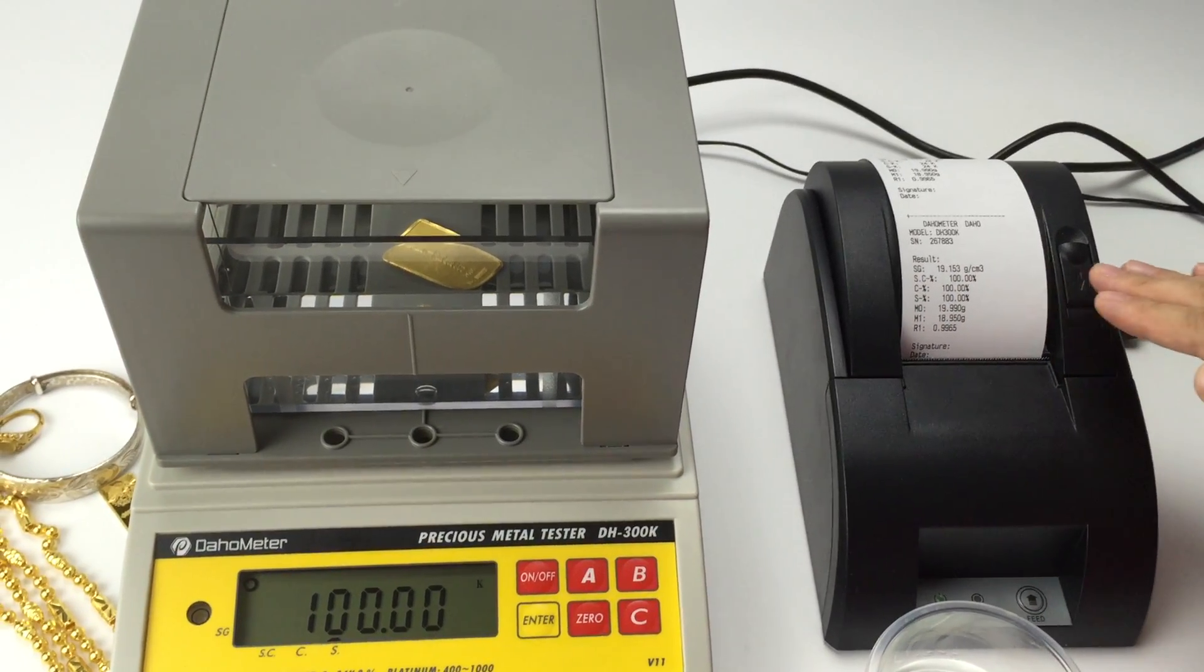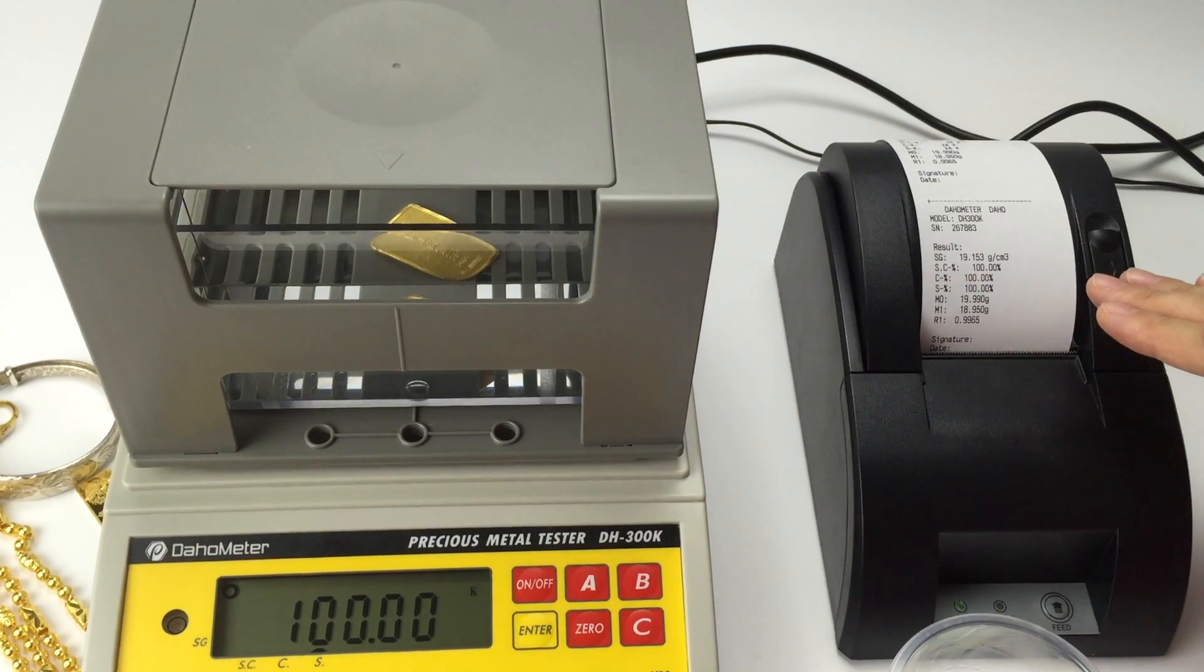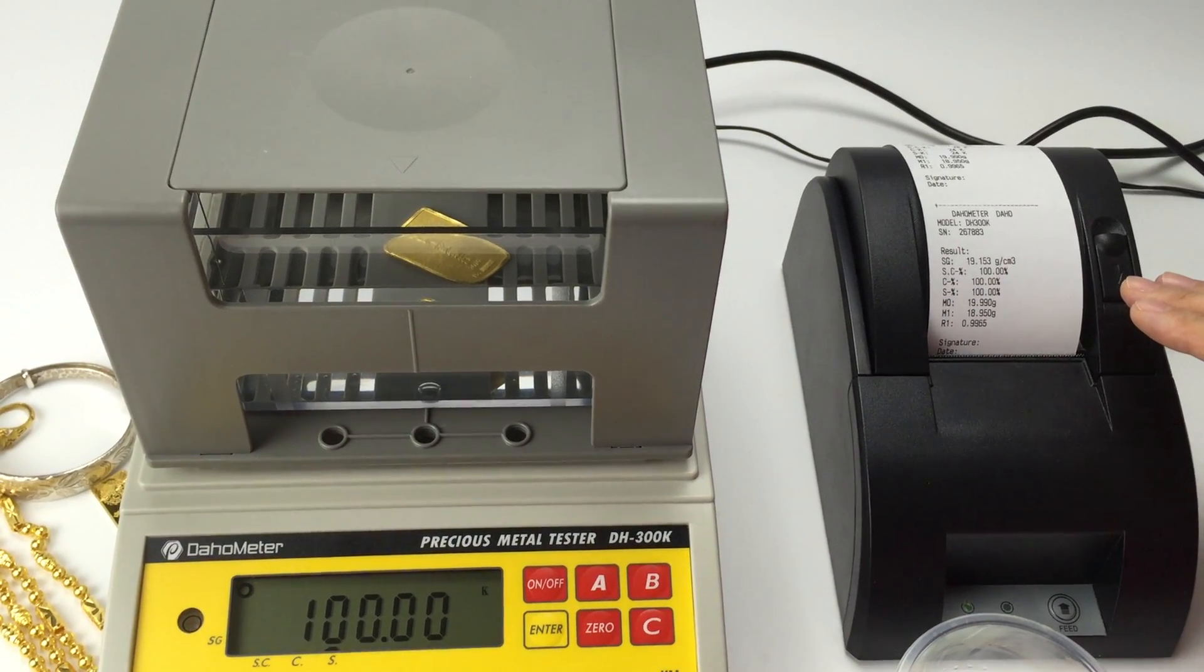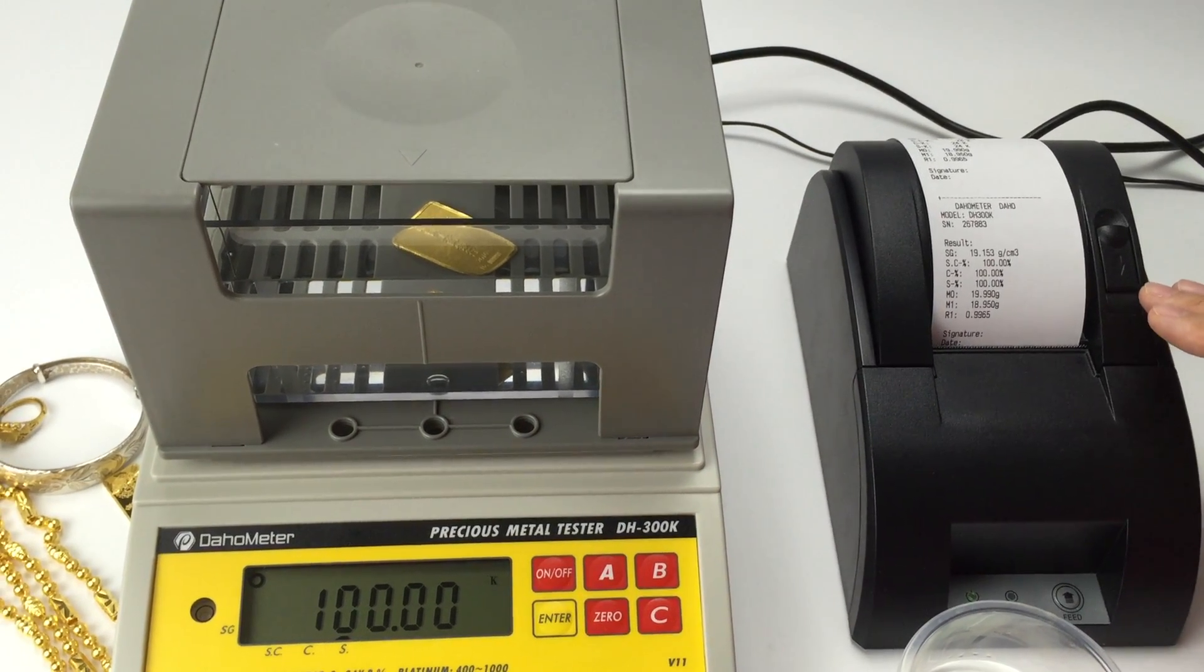SG is the density value. SC is the purity percentage for gold, silver, copper.